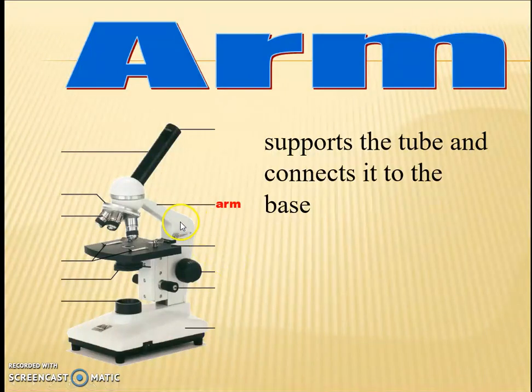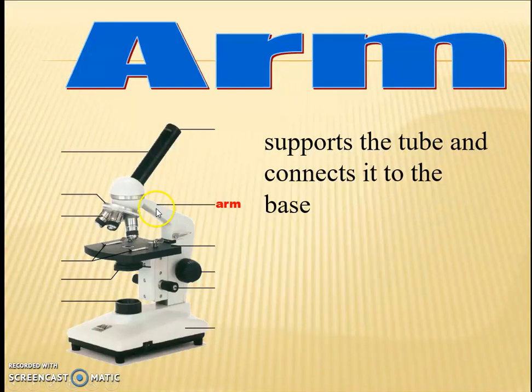Whenever you pick the microscope up, you are going to support the tube by holding the arm — the part that connects the tube to the base — and pick it up from there.